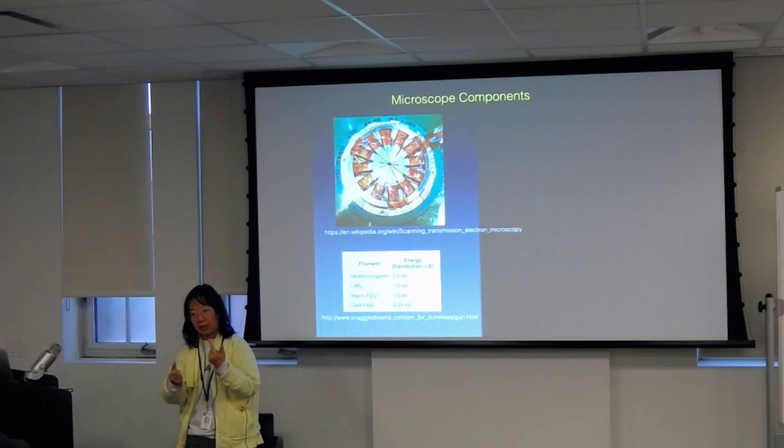So as we go down, we'll have better and better coherence in the wavelengths. Okay, so this is why the cold FEG is supposed to be the best one to use.